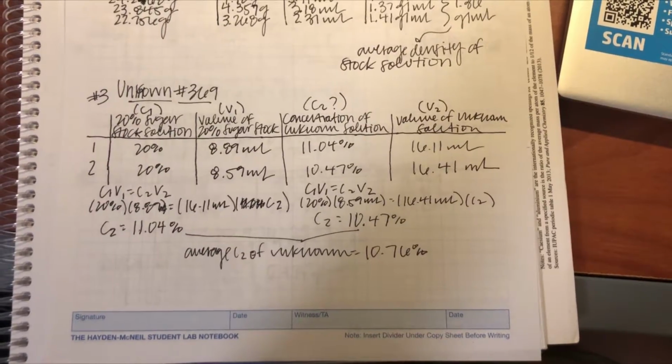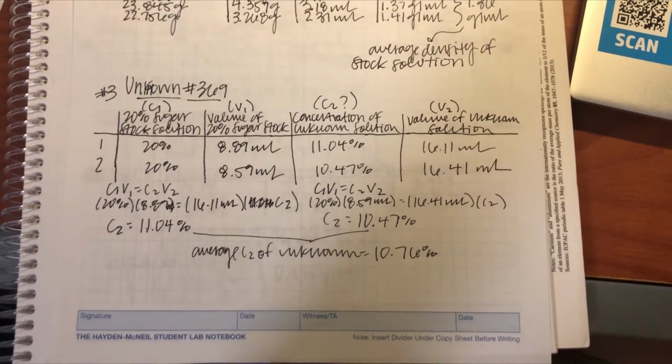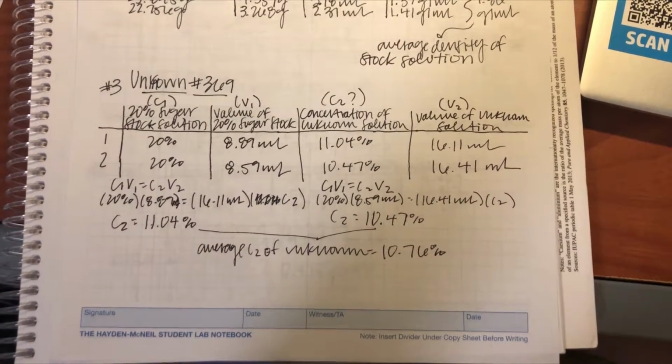This data was collected to determine the concentration of the unknown stock solution by using C1V1 equals C2V2, where C1 is the concentration of the known sugar stock solution, V1 is the volume of the known stock solution, V2 is the volume of the unknown stock solution, and C2 is the concentration of the unknown stock solution. The average concentration of the unknown stock solution was found to be 10.76%.